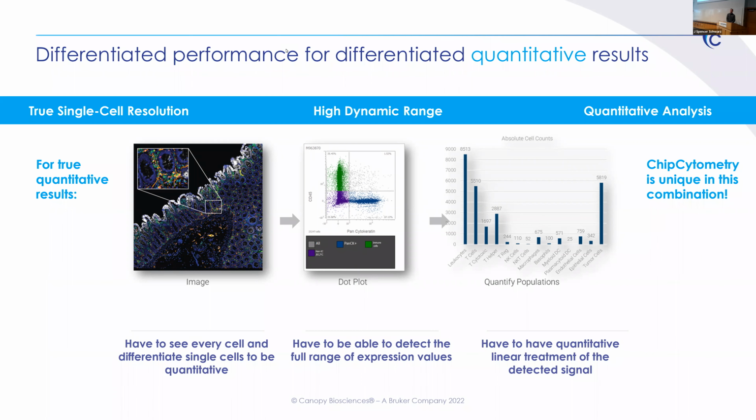What about registration between scans? Because we use photo bleaching, we can't use a fluorescence image for that, or at least we don't. So we actually use a bright field image and register using that. In process, the thing is aiming the field of view correctly. Once it's got it, then it switches over to fluorescence and takes the images. So it should be perfectly registered every single time.